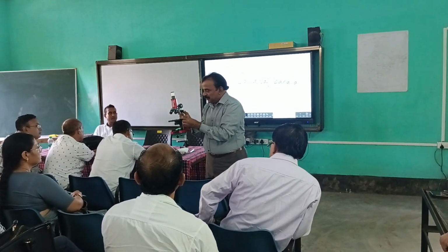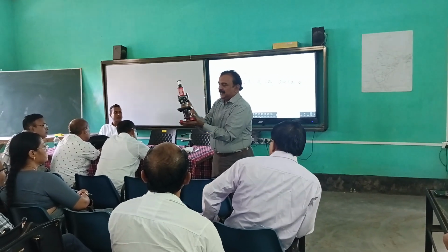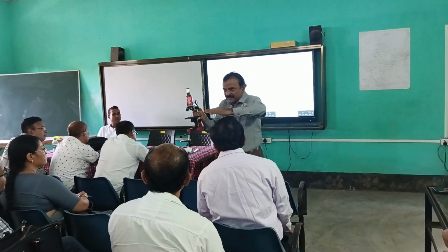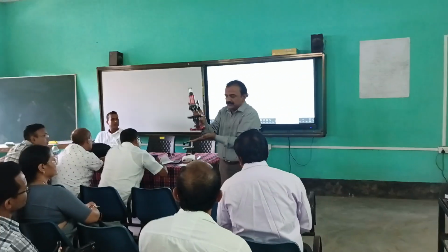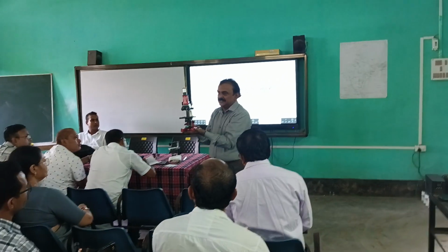Stage clips. So the stage is there, and stage clips are there, and the handle is there. And you see, friends, the mirror. It is plane, not so concave. And what is this one? Base or foot. Base or foot.